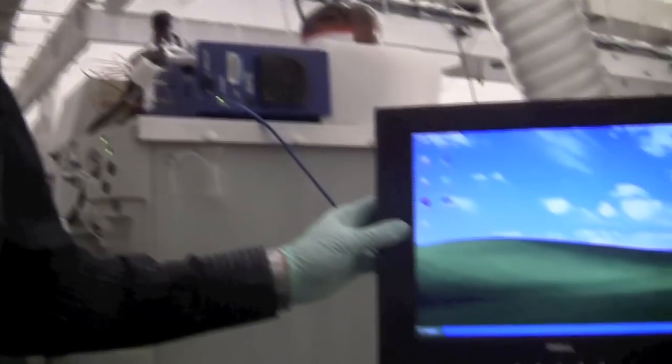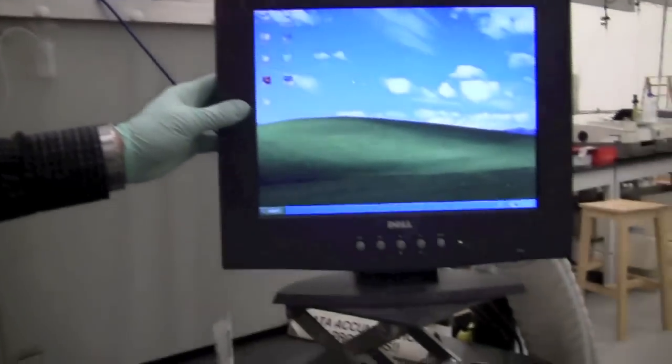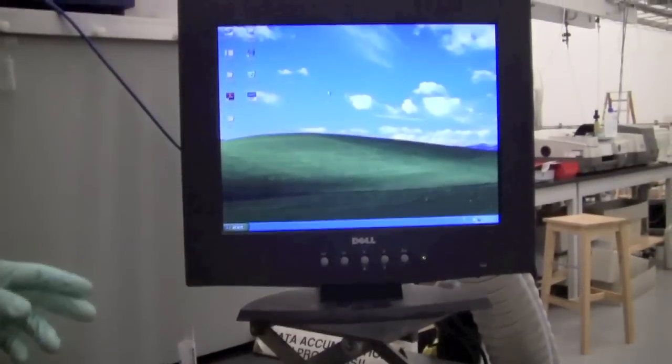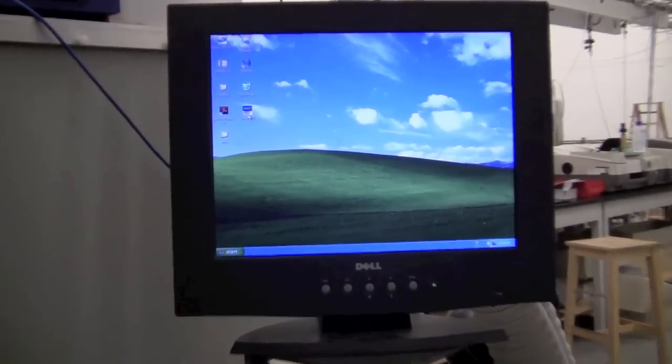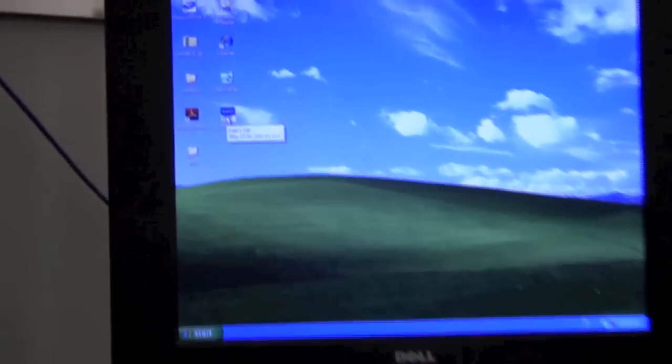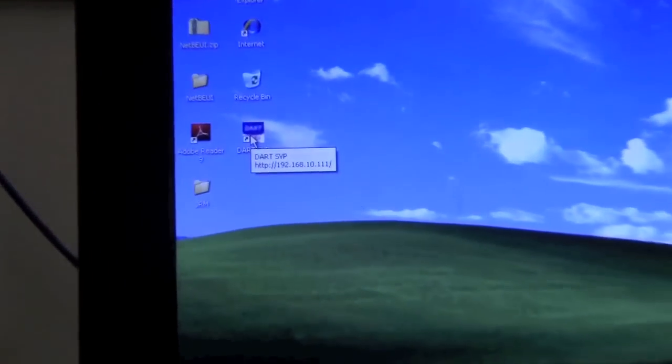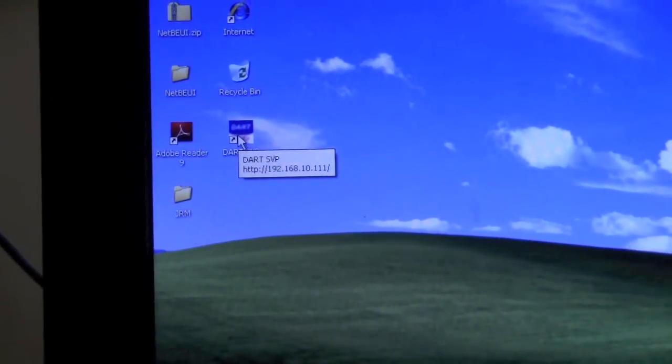This is a demonstration of how to use the ZQ mass spectrometer with the DART source. So when you come to the instrument everything may be closed. The first thing you want to do is to open the DART page to get the DART source started.